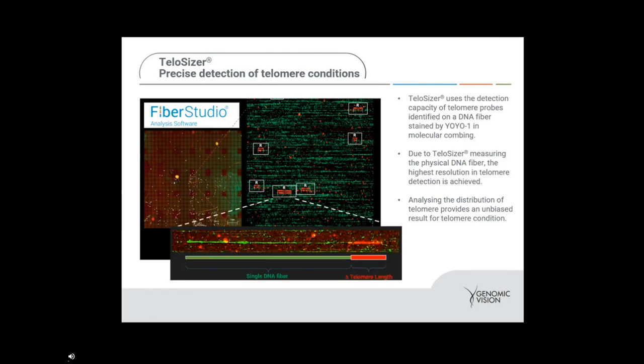Our technology provides not only the individual lengths of each telomere, but also the distribution per subject and an unbiased result for telomere condition. Here's an example of the types of images you would get — a long green single DNA fiber with a red telomere length — with numerical values on each. You see the changes in telomere length along with the distribution and high-resolution images.